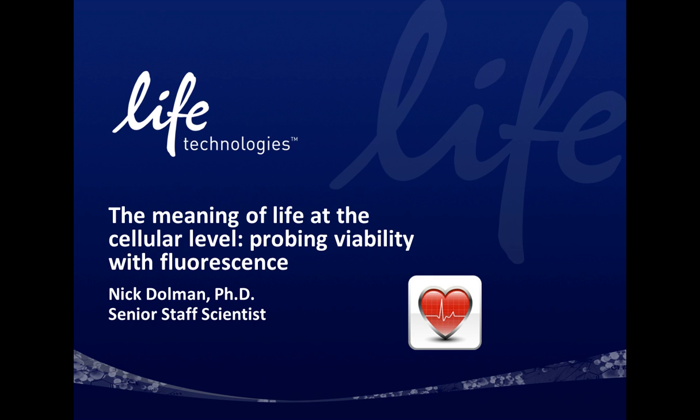This is the first of 4 seminars on cell health, and today we'll be talking about the basic changes that happen when a cell goes from living to dead, and ways to read that out.